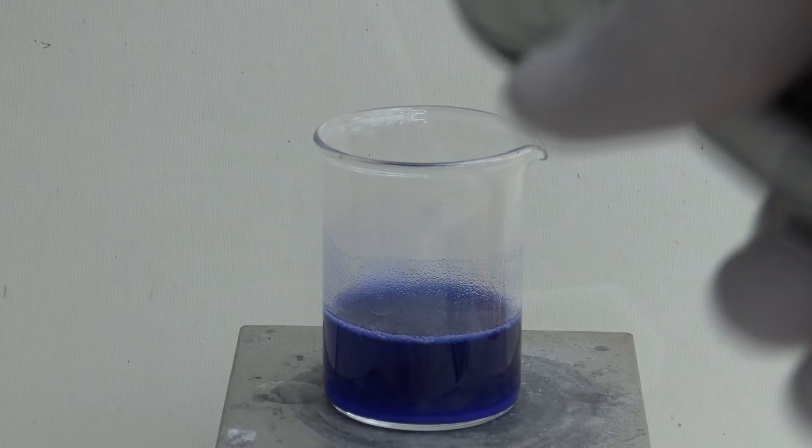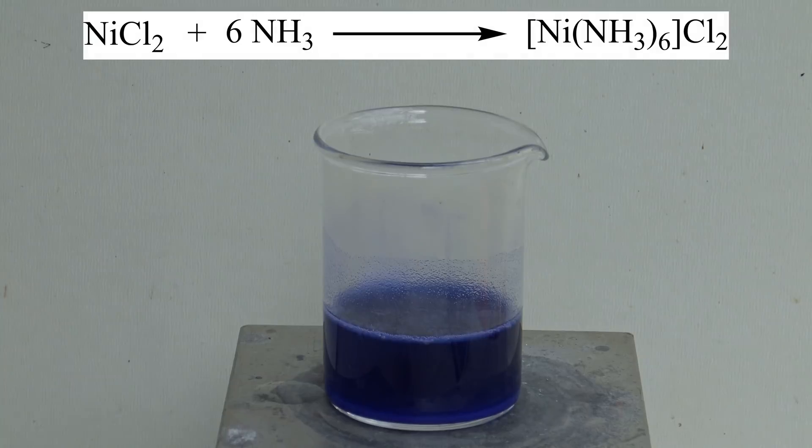The following reaction takes place: the nickel chloride reacts with the ammonia to form the complex hexamine nickel chloride. This precipitates, which is increased by the addition of the ammonium chloride.